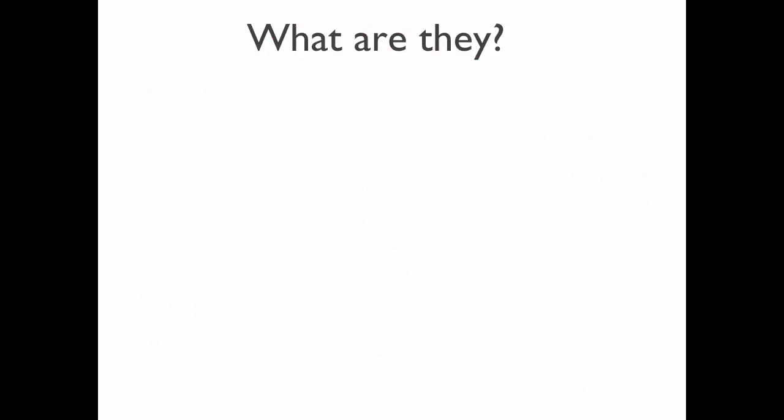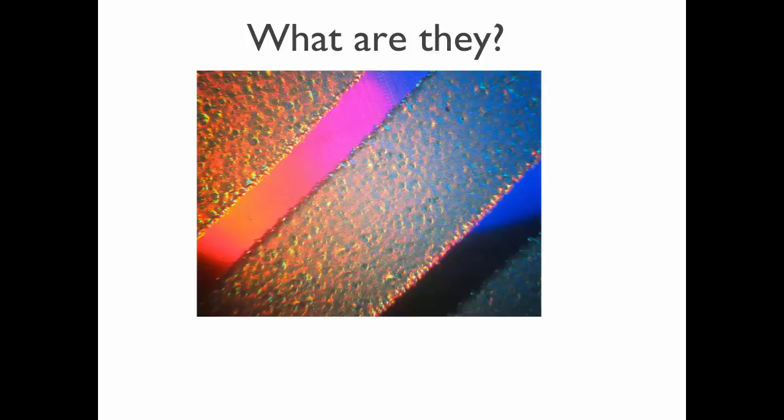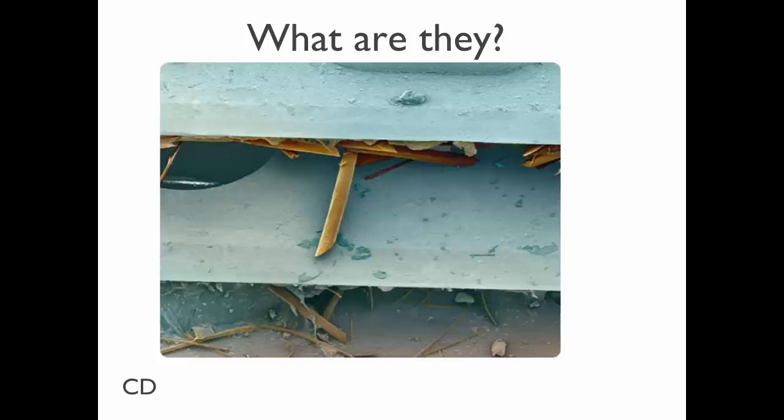Let's look at some images. See if you can guess what these things are. Raise your hands if you want to take a guess. These are all things viewed under a compound microscope. Lindsay? What's that? No? It's actually a CD or DVD. Those are the layers. What's that?